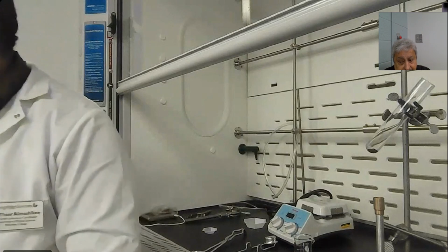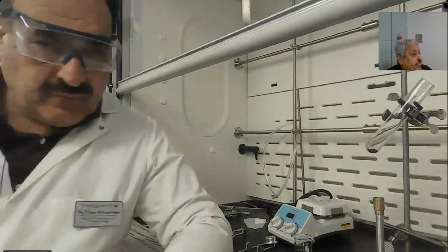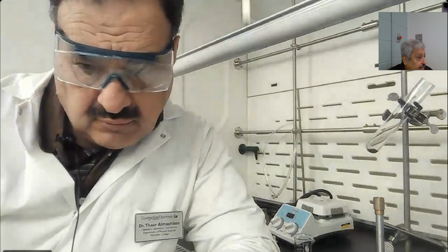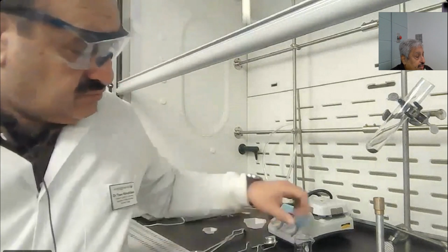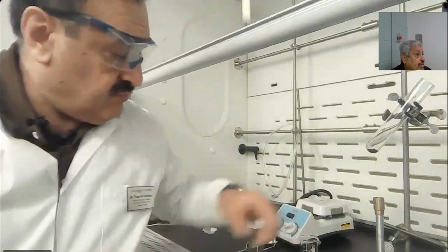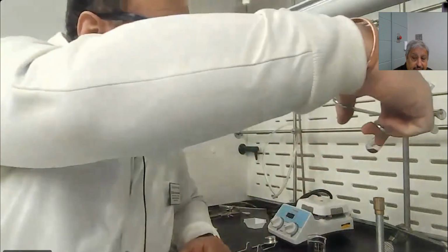And whenever you are taking the test tube, you have to turn the Bunsen burner flame out. Because if the flame is on and you have your hand in to grab, there's a possibility you will burn your jacket or whatever your clothing and your skin. So anytime you have to take the test tube in and out, you have to turn the gas off. The Bunsen burner off. Use the tongs to hold it this way and put it inside the beaker.